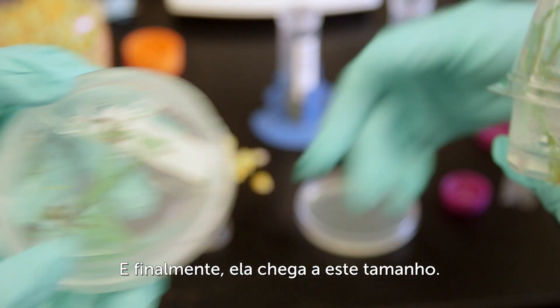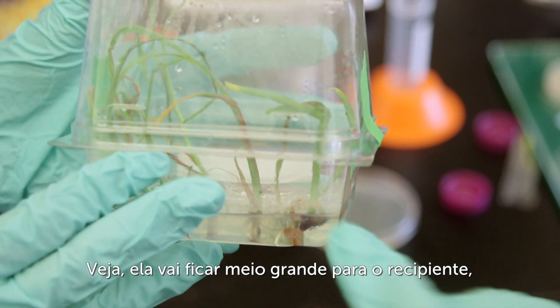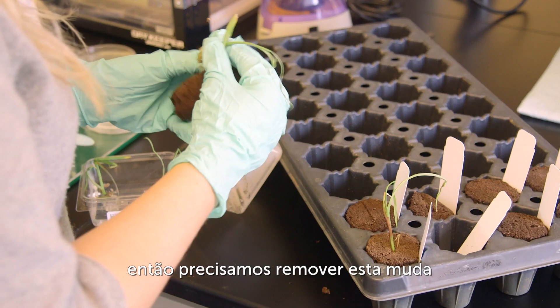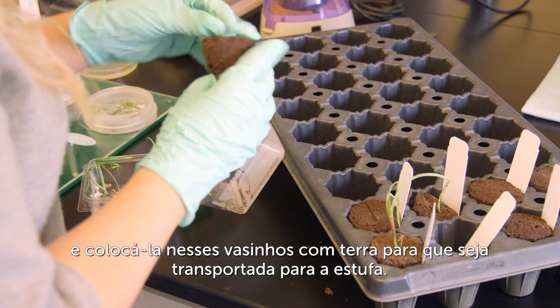Eventually the plant will start to grow roots and shoots, and then get up to this size. When it gets a little too big for the container, we remove this little seedling and put it into a soil plug so it can go up to the greenhouse.